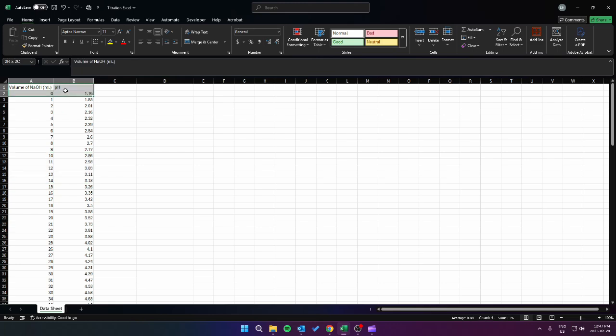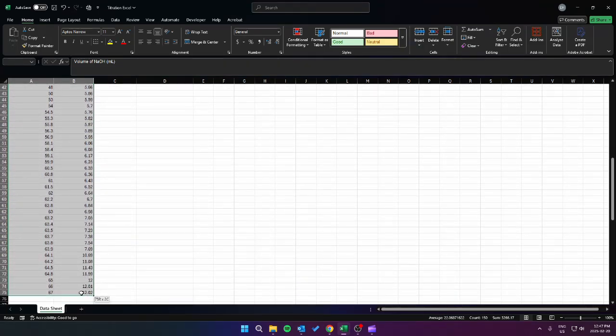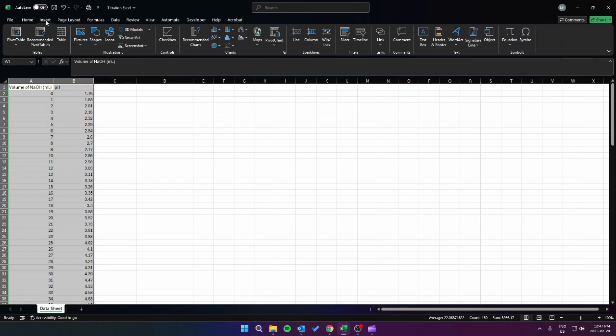With Excel, that means we're going to select all this data here. So I'm clicking and dragging and selecting all the data, including the headers at the top. We're going to go over to Insert at the top bar, and move over to the Charts section. Just above Charts in my version, you can see this axis with some blue dotted lines and some white dots. We're going to click on it, and click on the first option here, Scatter.